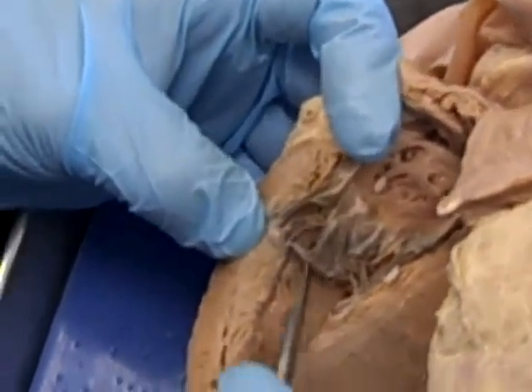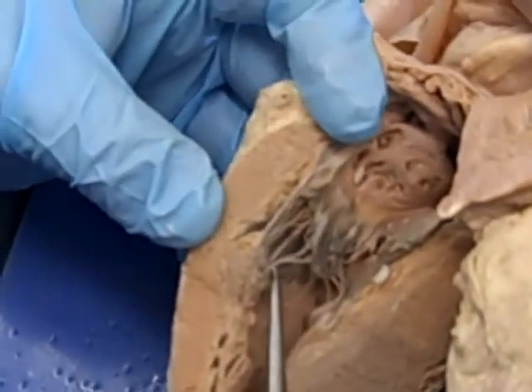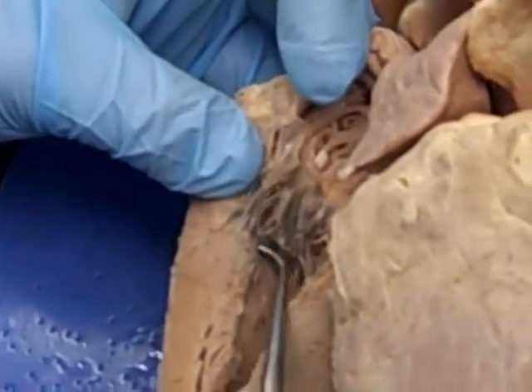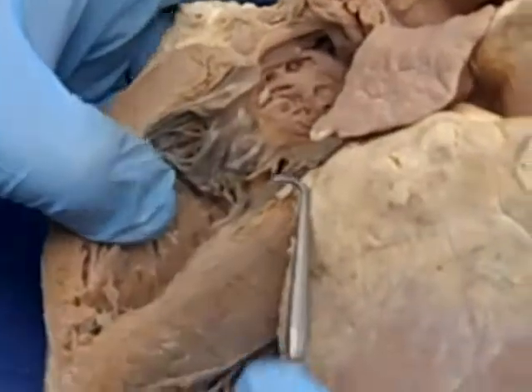You can see the chordae tendineae attach at their other end to a small structure projecting from the wall of the heart — that's a papillary muscle. It looks a bit like a pimple. The papillary muscles project from the heart wall, and we'll talk about their function in lab.